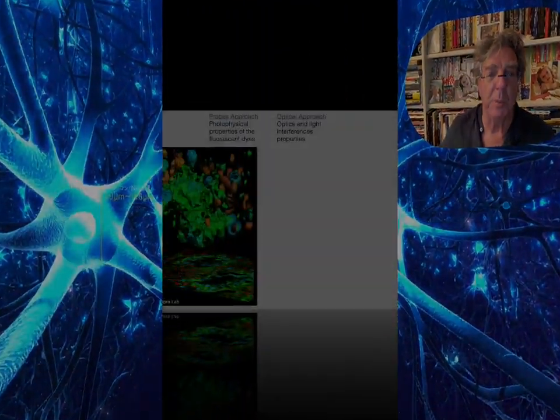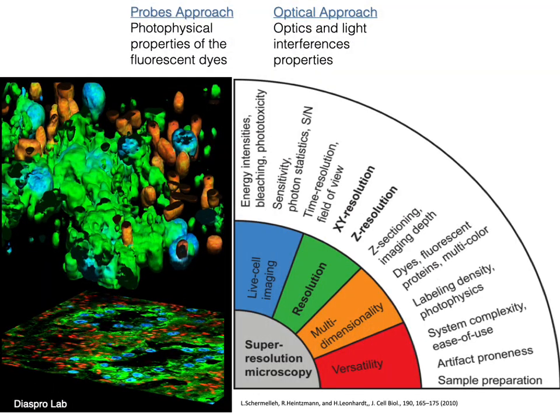Here what you see is the intricate world of the biological cell, with a network all around made through interaction. But now, when you go through the development of your microscope, you have a lot of questions arising. And let me tell you that you can consider today two different approaches. One is the probes approach and the other one is the optical approach.